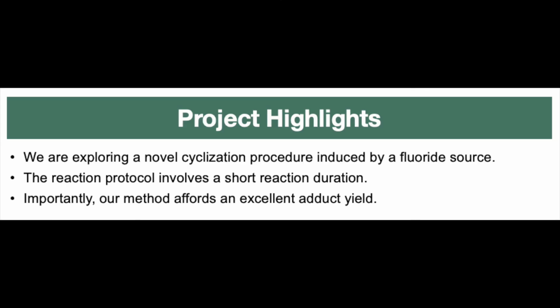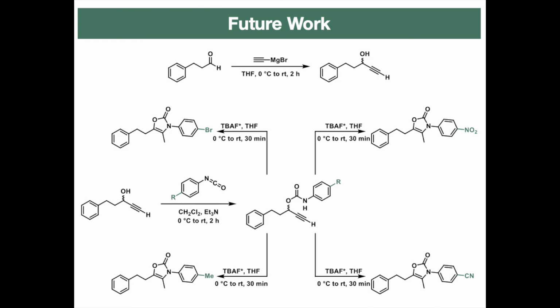To conclude, we are exploring a novel procedure to cyclize oxazolones using a unique fluoride induction technique. From the results so far, the adduct has been obtained in high yields around 95% yield, using a catalytic amount of fluoride source in a very short reaction time, increasing the desirability of this procedure based on early results. Our future work aims to explore the substrate scope of the aryl group more deeply, such as by introducing bromo, methyl, cyano, and nitro groups.